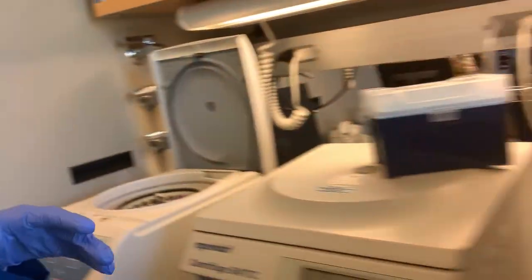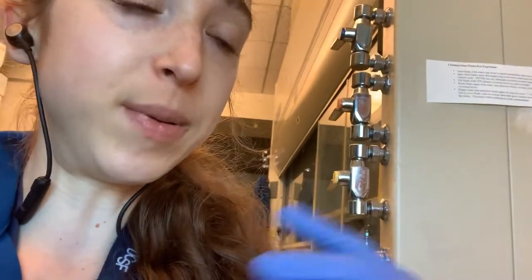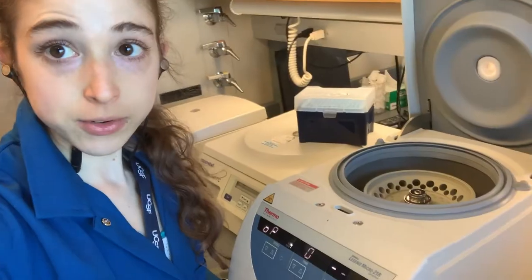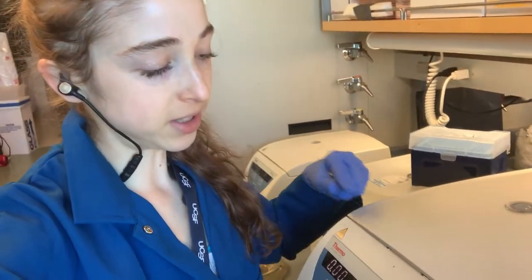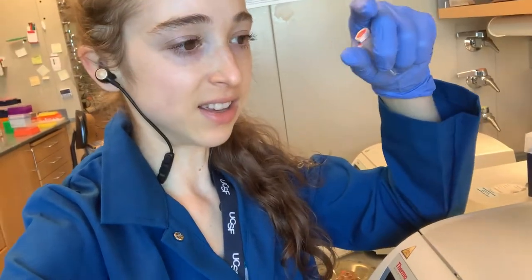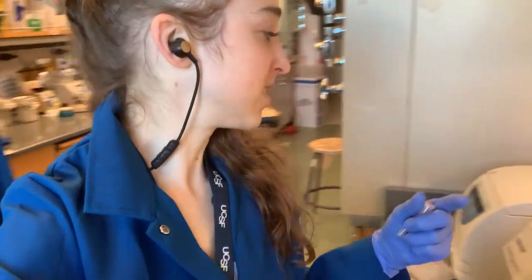Some microcentrifuges have refrigeration. They often have a quick temperature-setting mode, though sometimes it's not so quick — it does a spin-down before getting to the right temperature. Make sure the centrifuge is actually at the right temperature before you use it. If you need it at 4°C, it might not be there yet — you can feel inside to confirm. When you have a cooled centrifuge, keep it closed. If you leave it open, it'll keep trying to cool itself, get icy, and that's not good. It's a good idea to keep centrifuges closed anyway to avoid contamination.